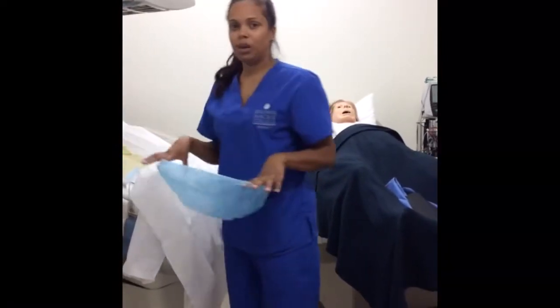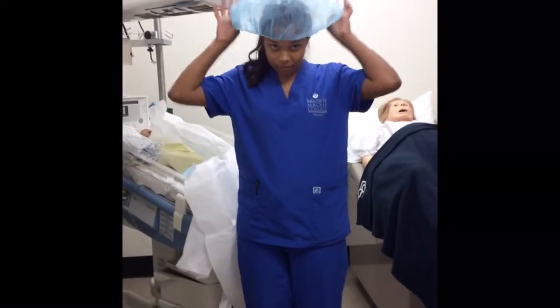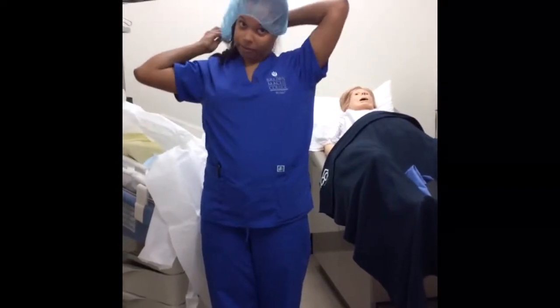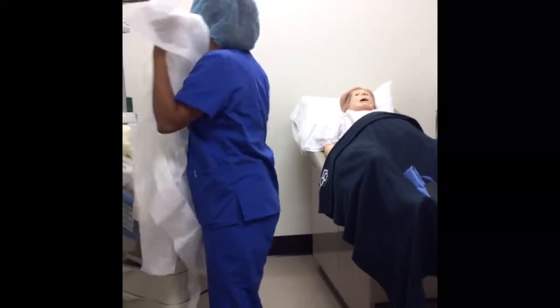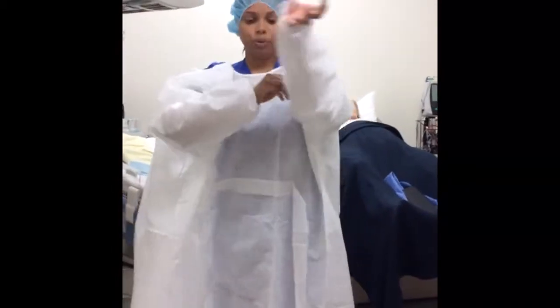The first thing you put on is your cap. Make sure your hair is inside of the cap. The second thing you do is put on your gown. When you open your gown, make sure if it's too small, you can wear two.